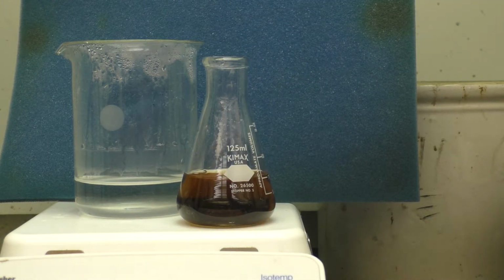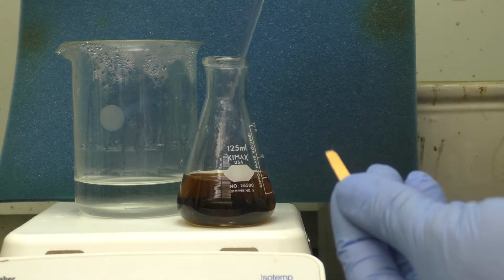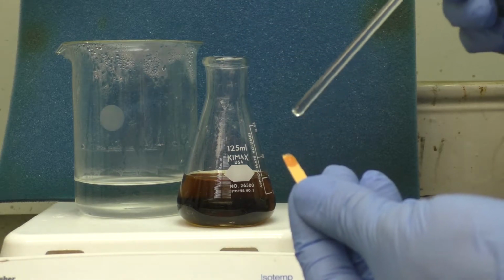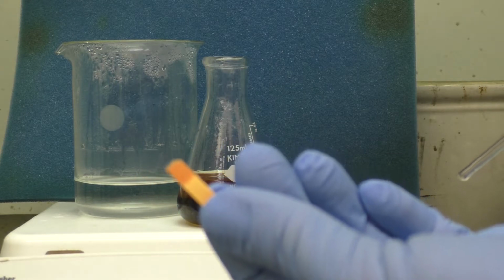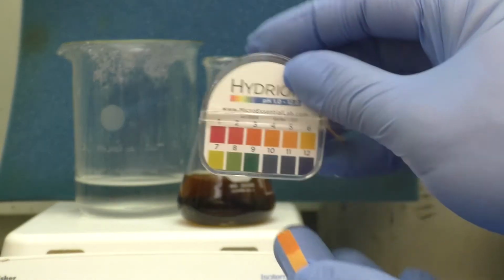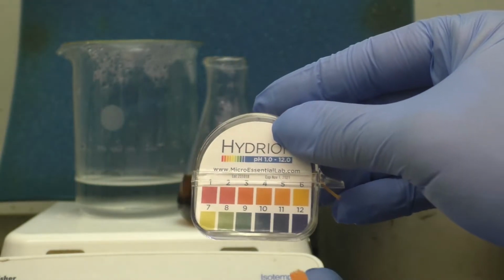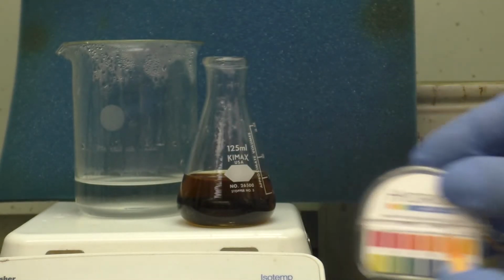Just because I used so much HCl earlier, I'm going to quickly check the pH of the solution using some pH paper. So here I am acidic, but I'm not horribly acidic. Only sitting maybe around the 5 range, pH 5, so this should work.